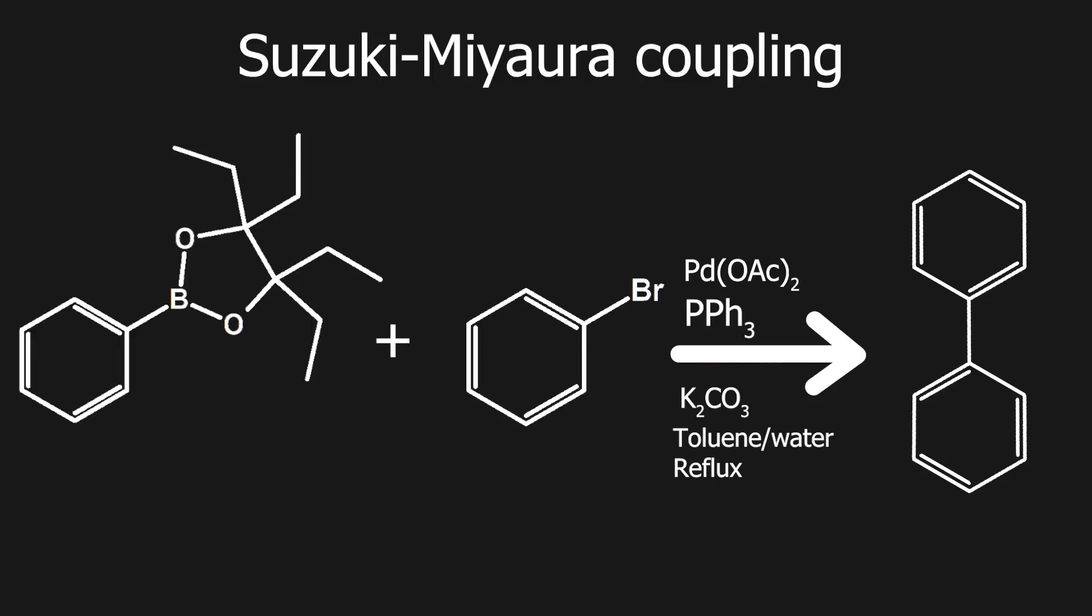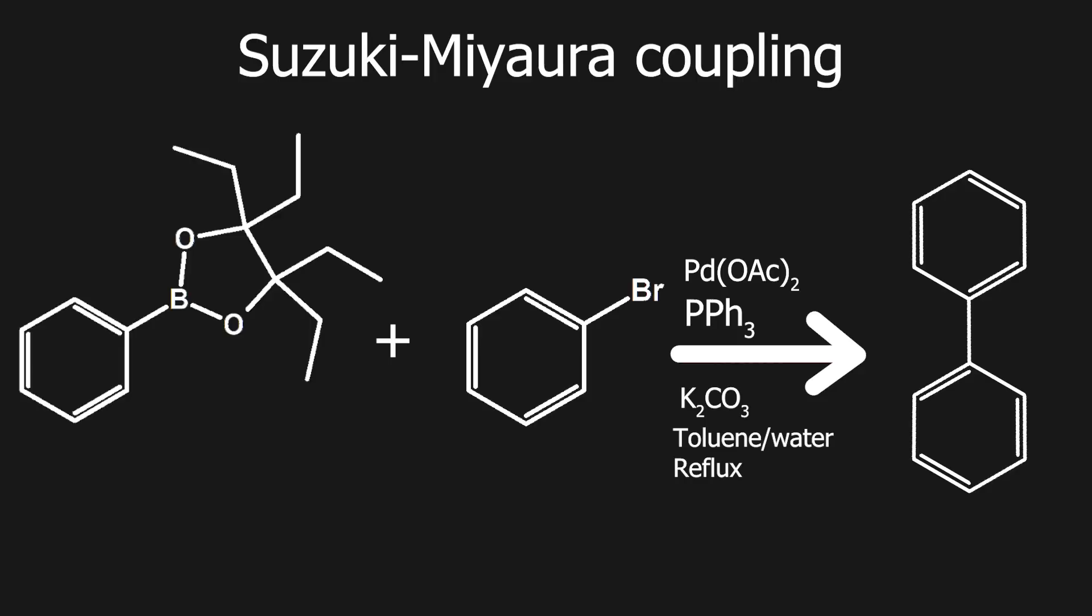When the phenyl B-epin is further purified, we can do a Suzuki-Miyaura coupling reaction with an aryl bromide like bromobenzene to test it out. For that reaction, I will use a general unoptimized procedure. So it will likely not be the best result. But still, it is very likely to at least give some product.